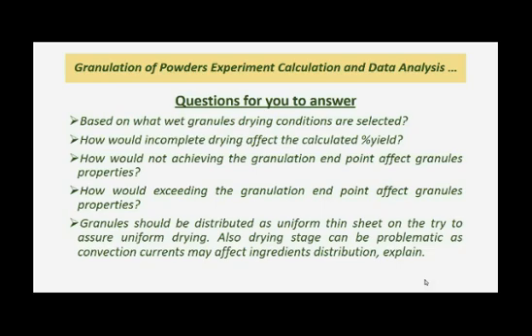Remember, this will contribute toward the estimated practical weight being higher than expected. Then, the percent yield will be higher than expected. How would not achieving the granulation endpoint affect the granules properties?